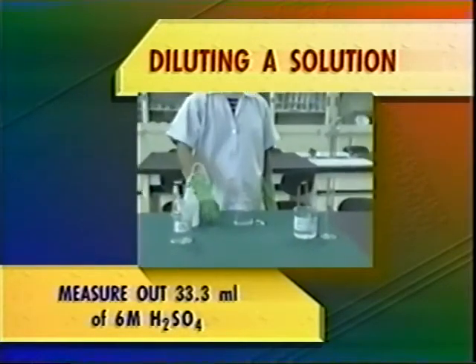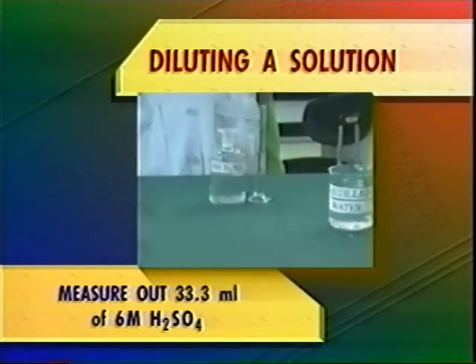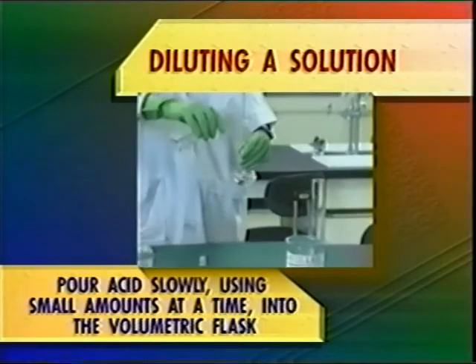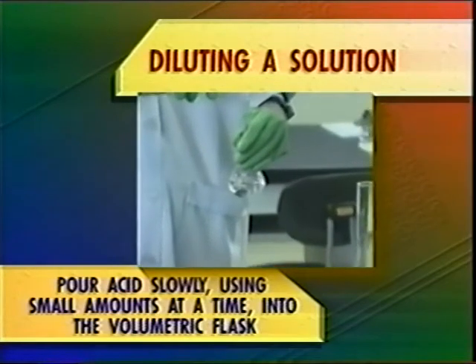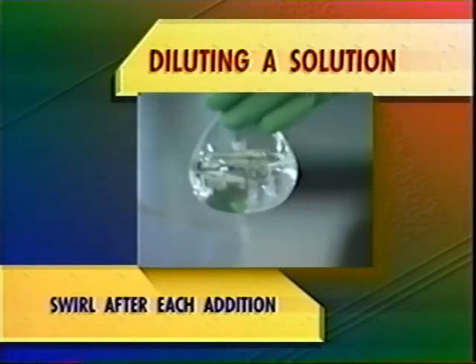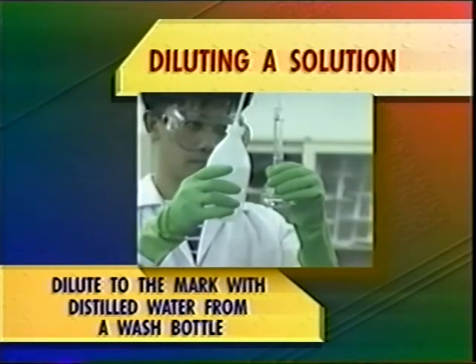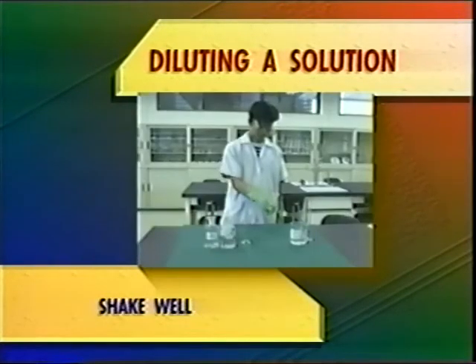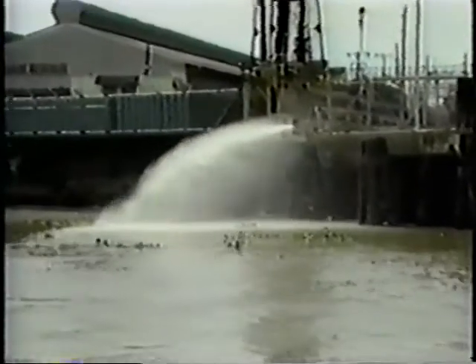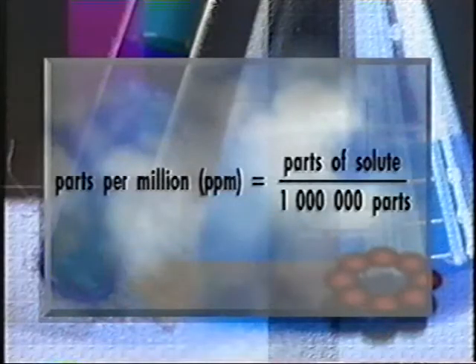Measure out 33.3 ml of 6 molar sulfuric acid. Pour this slowly, using small amounts at a time, into the volumetric flask. Swirl after each addition. Dilute to the mark with distilled water from a wash bottle. Shake well.